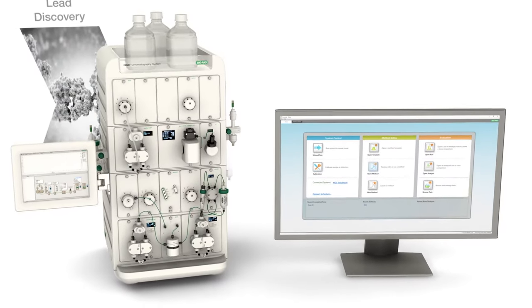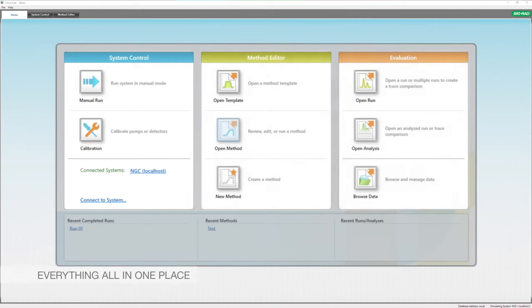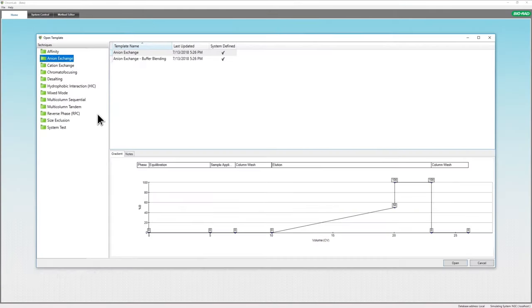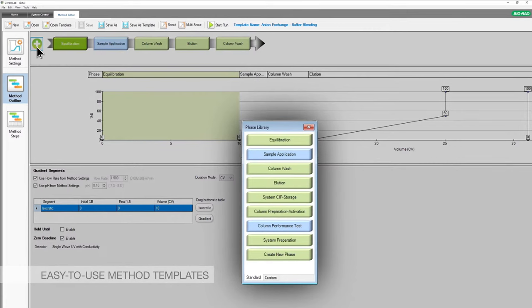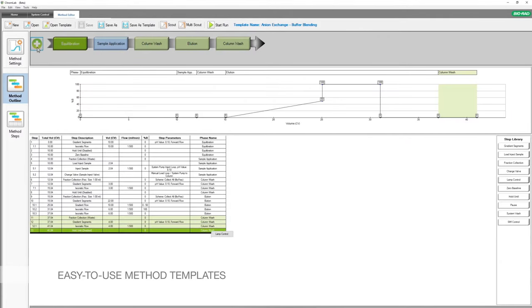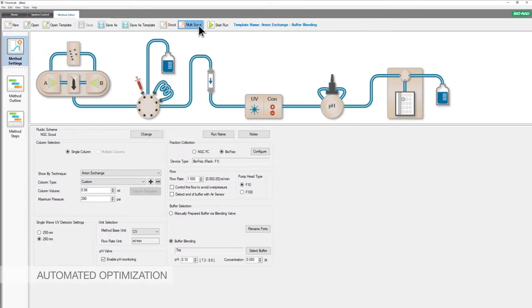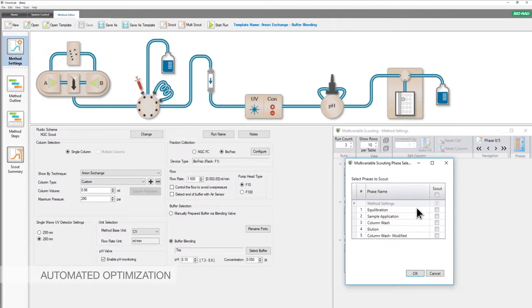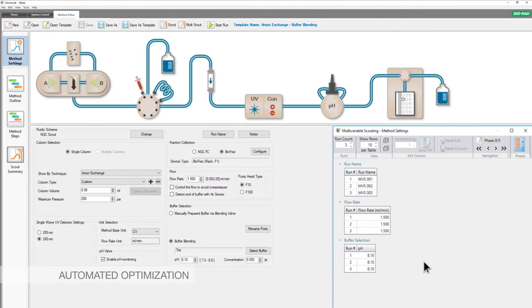ChromeLab is designed to make your methods quick and easy. Use method templates grouped by technique. Methods are created based on phases with the ability to insert steps if needed — no block programming required. Scouting features help find ideal purification conditions automatically; focus on one parameter at a time or easily evaluate multiple conditions with multi-variable scouting.